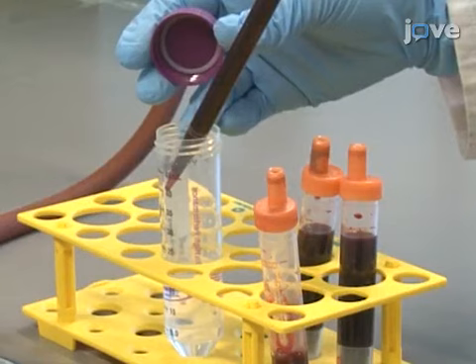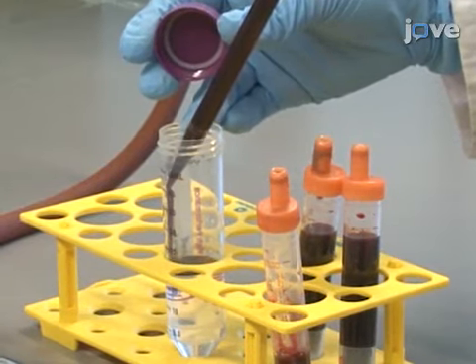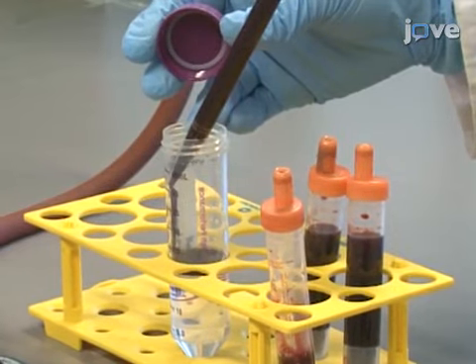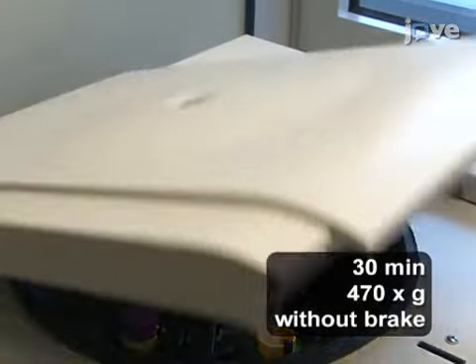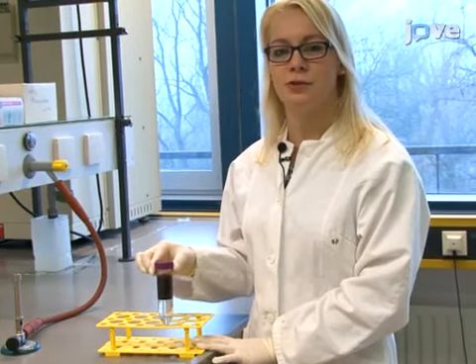To isolate human blood-derived neutrophils, layer approximately 20 milliliters of blood onto 20 milliliters of sodium diatrizoate dextran solution near a flame without mixing. Centrifuge for 30 minutes at 470 times G without braking. It is critical not to mix the blood phase with the density gradient solution.